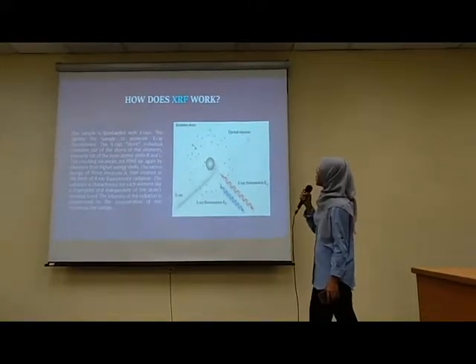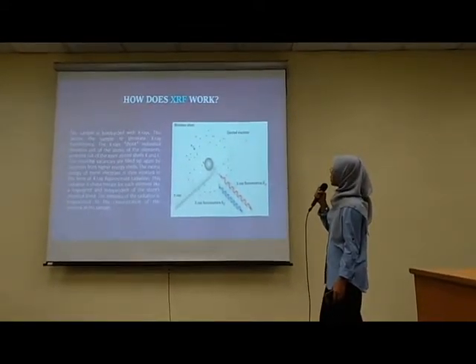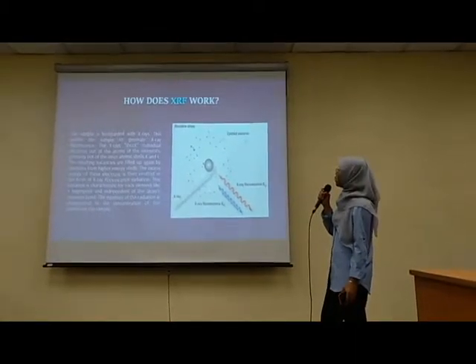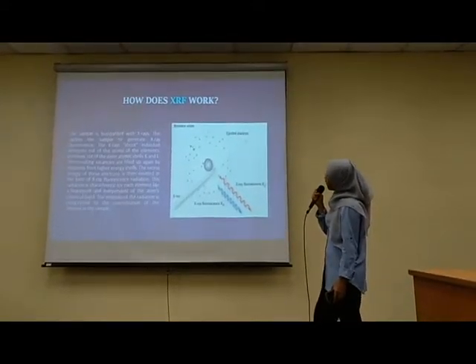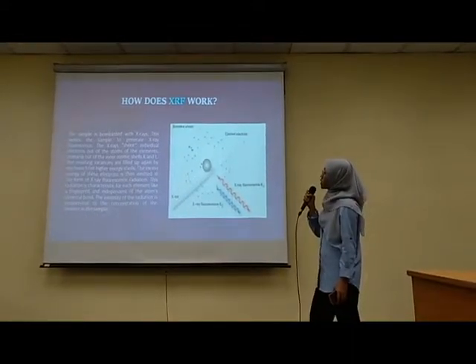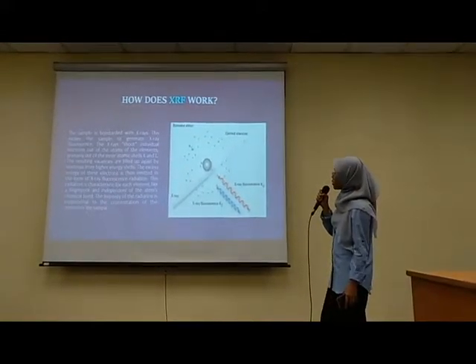Okay, the sample is hit by X-rays. This is when the X-ray hits an electron from the inner shell. The electron will leave the atom, and then the vacancy in the inner shell will be filled again by an electron from a higher energy shell. And then this radiation is characteristic for each element, independent of the chemical bond of the atom.